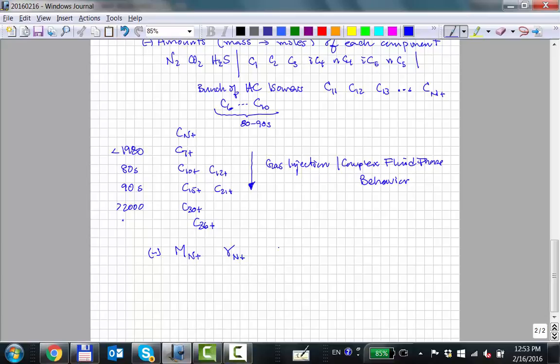So these definitely have some uncertainty to them, for sure. Guaranteed probably with no better than 10%, maybe 15% for different reasons. This one is probably better than 1%, probably. Unless you have a very, very strange oil, a very, very aromatic oil, or very, very paraffinic oil.